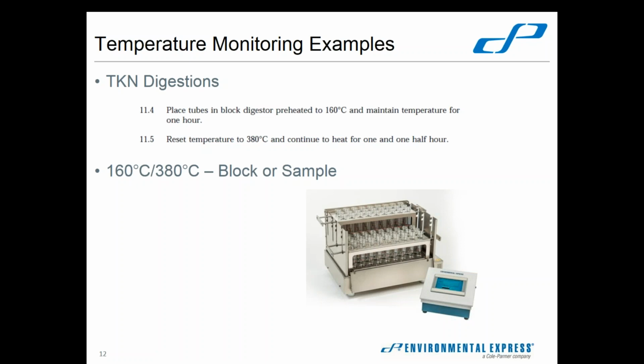So the only really great way to measure the temperature of that block is measuring the block itself directly. Unfortunately, again, I don't know of any good contact thermometers that are set for 380 degrees. So what we've got is the thermocouple that is already drilled into the block and connected to the controller that is telling you the temperature.